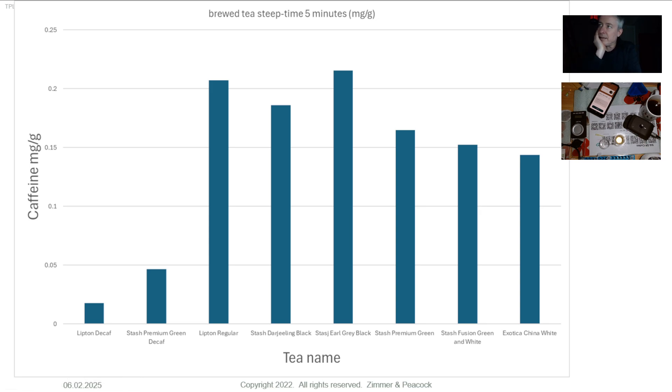Just to set expectations: if we brew tea, we may end up in the range of something like 0.05 milligrams per gram to approximately 0.2 milligrams per gram. But let's find out what we actually get. This is a very different kind of video — people talk about caffeine in tea, in coffee, in energy drinks, but nobody does live demos. I'm also going to test an energy drink at the end of this as well.